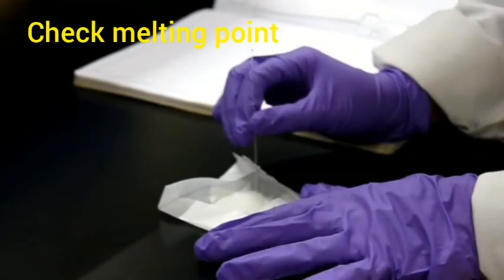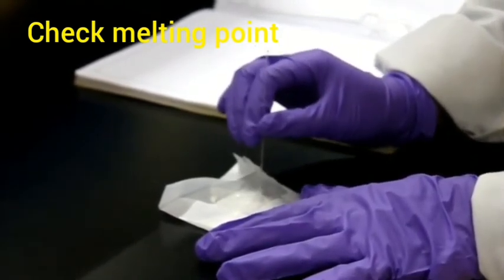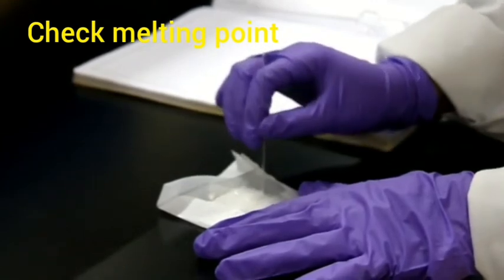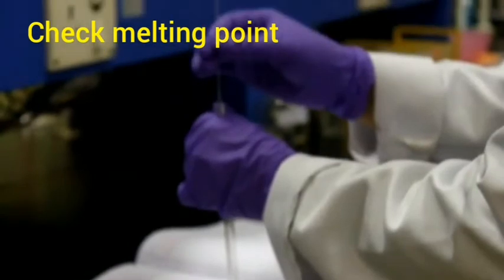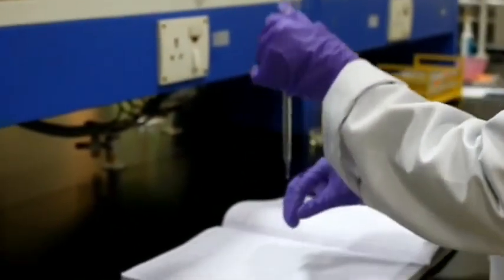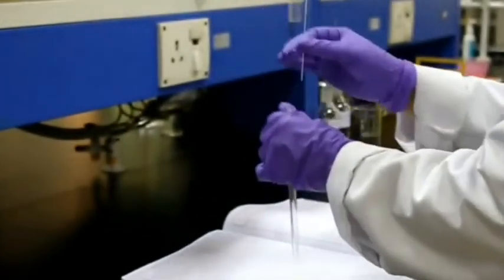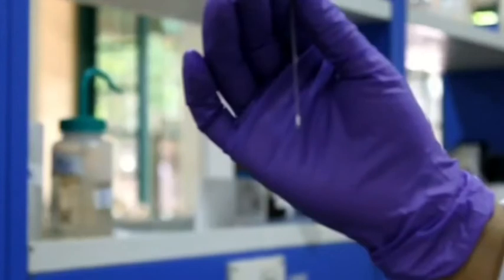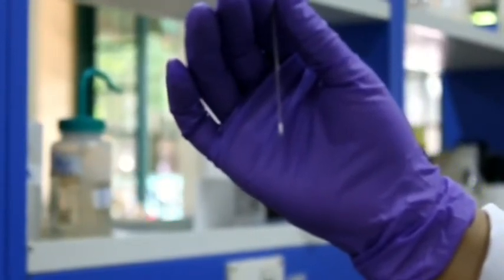Now we are checking the melting point of the product. So we are packing the sample in a capillary tube. Drop the capillary tube through a long hollow tube. Now the sample is packed properly.